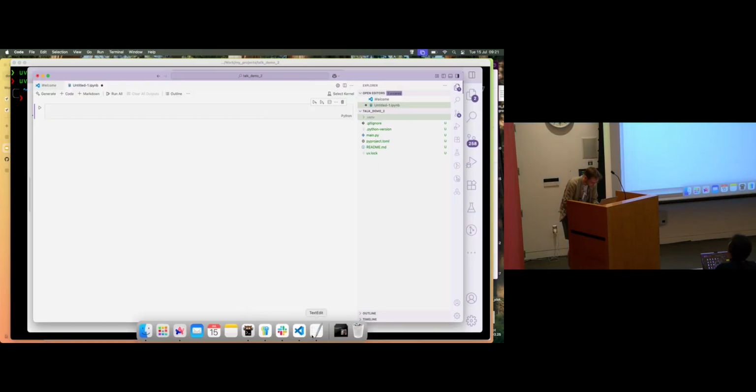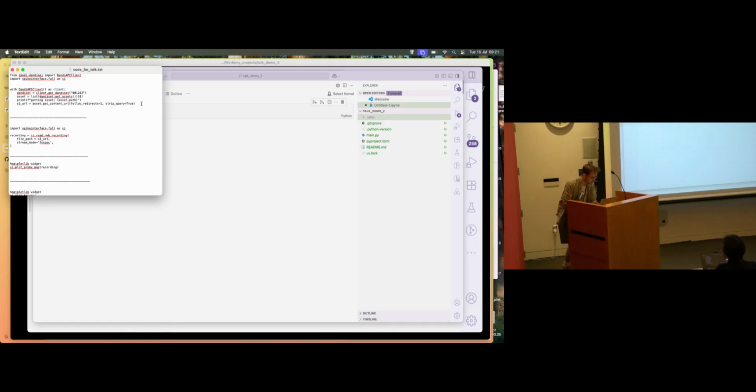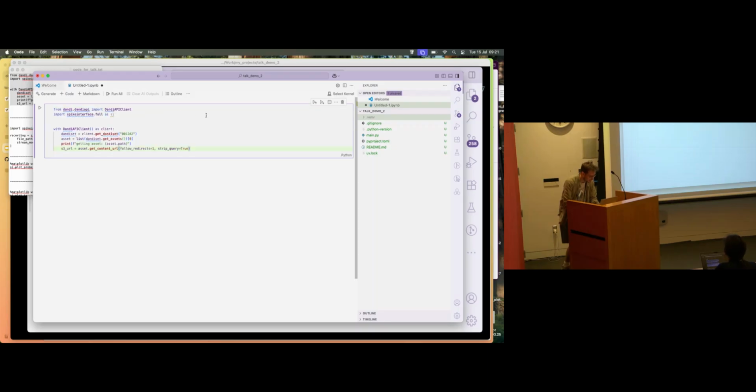Okay. And if you run that, you will create the same environment that I just made. So I just installed SpikeInterface and all the Dandy API stuff in a one-liner. Very easy. If you're following along, you can create that environment right now. Okay, but this talks about SpikeInterface. So it'll be the only environment that's around.